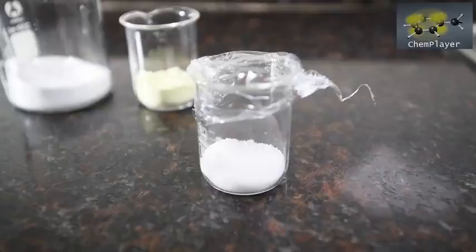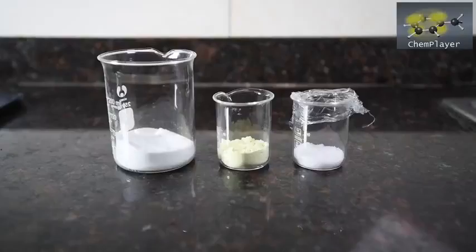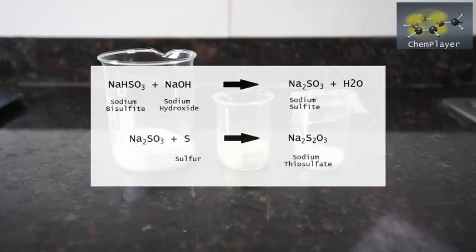And finally we've got sodium hydroxide — 11.5 grams of it here, which is stoichiometric with the sodium bisulfite. Basically the sodium hydroxide is going to react with the sodium bisulfite and form sodium sulfite, which is then going to react with the sulfur, sucking up an extra sulfur atom and forming sodium thiosulfate.